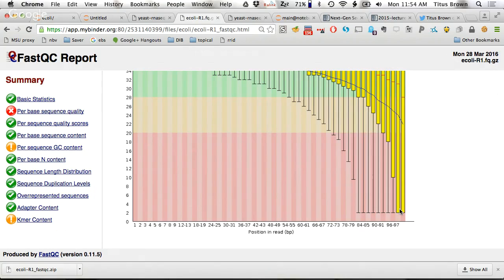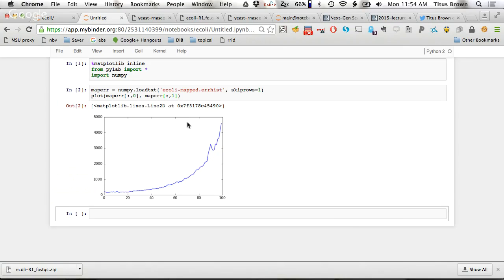So I guess what we'd have to do is spin things out into quartiles or something to figure out whether or not this quality score estimation was correct or not, right? You expect this profile to follow the other profile pretty well if Illumina knew what they were talking about. But probably too much right now.